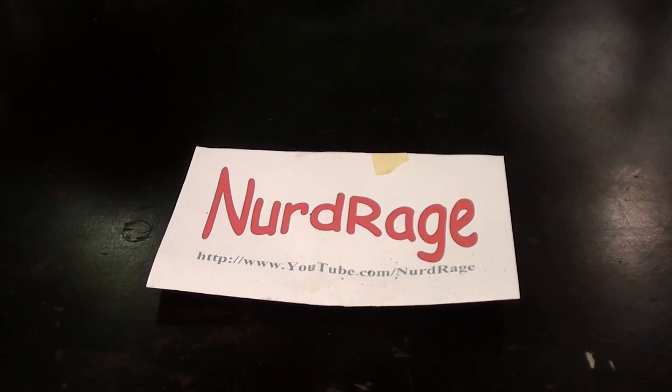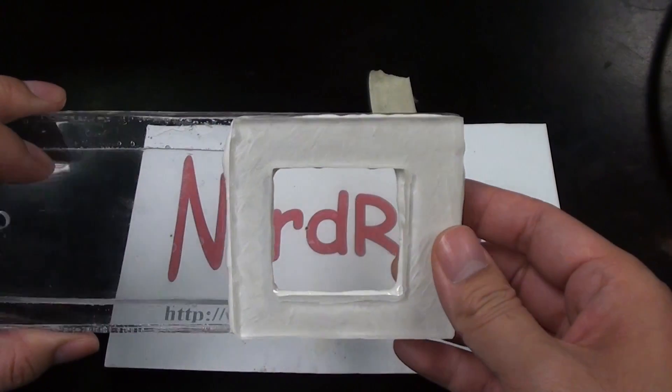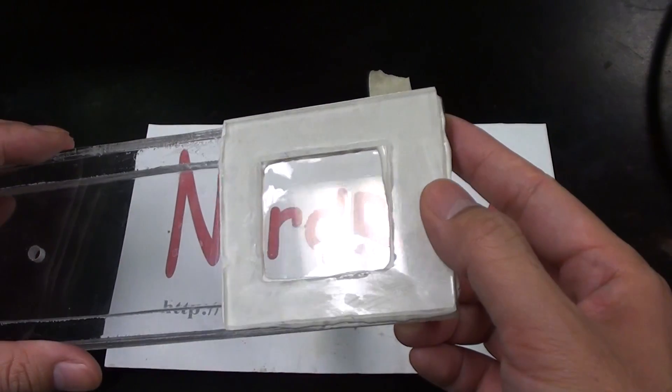Greetings fellow nerds, in this video we're going to make a membrane divide cell based on Nafion, a cationic exchange membrane.